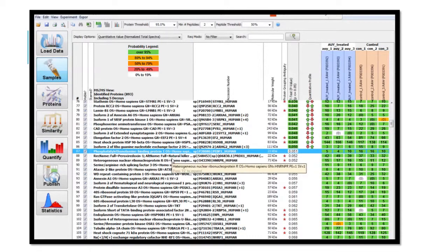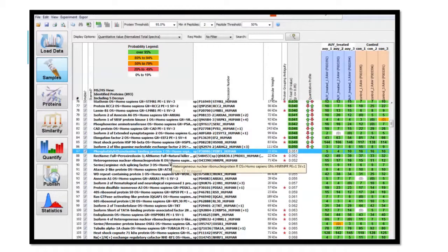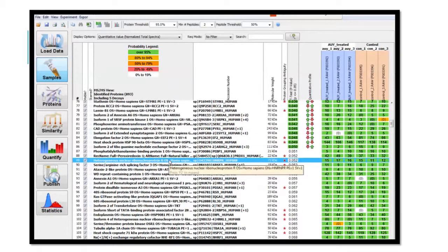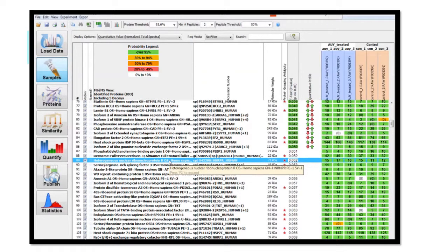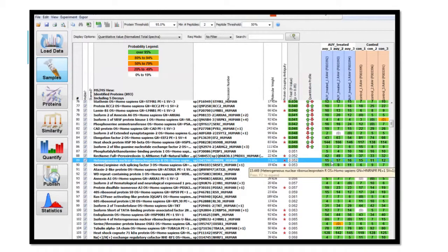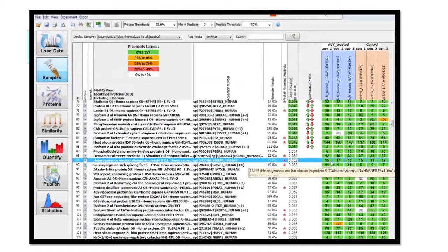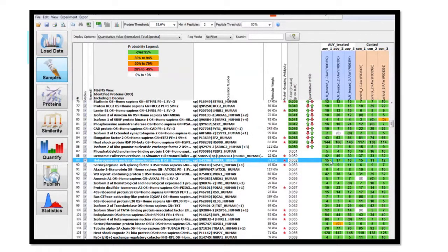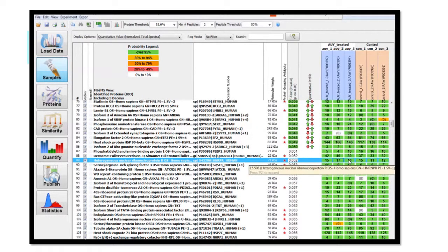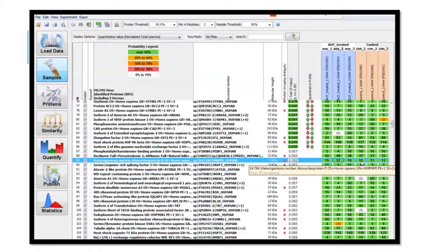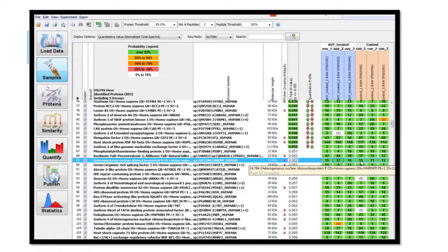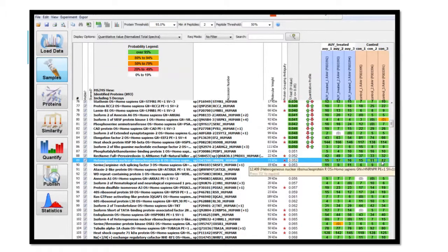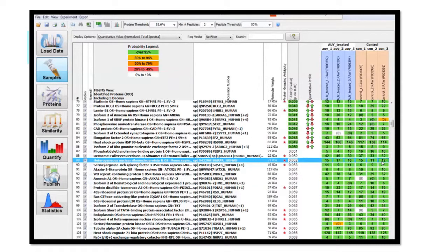Conversely, if I look at heterogeneous nuclear ribonucleoprotein R data, it appears that this protein is expressed in greater amounts with values of 15, 17, and 16 in the treated cells when compared to the control cells with values of 15, 11, and 12.